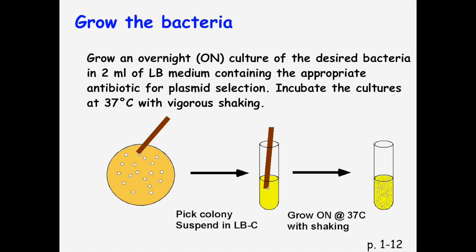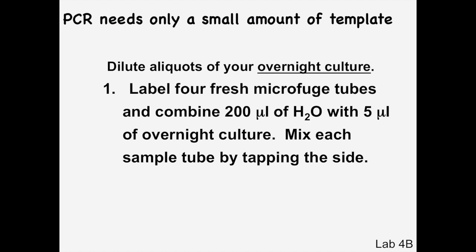So this is just reviewing what we've already done, where we grew the colonies and we labeled our tubes. And remember that when we do PCR, you're going to take your overnight culture and dilute it with water.